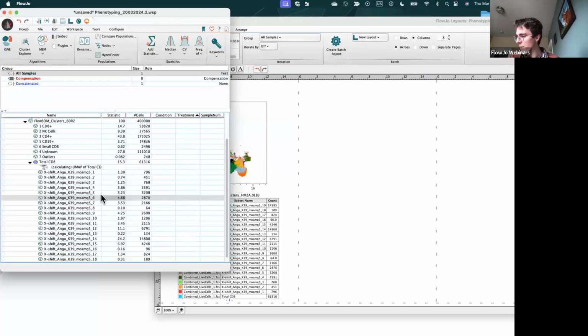Yeah, while that UMAP is running, more questions. Now's a good time for more questions. We have 8 minutes left, and I have a lot more I want to show. So hopefully it finishes quickly.